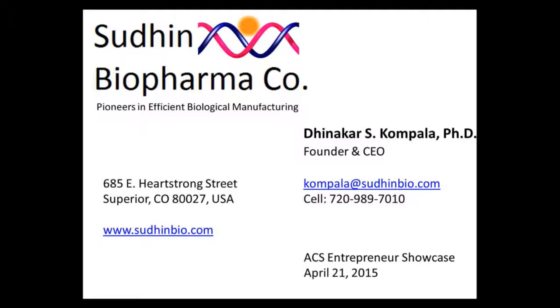So you separate 2 micron sized particles from 4 micron sized particles? Yes, and that has not been possible with the previous design. With our design right now, we're working with yeast cells that are 5 micron, and the dead cells are probably 3 micron or smaller. So it's very close, but not exact. The smaller the cell size, the larger the device you need. But because it's a 3-dimensionally scaled up system, all you need is to add one more layer of rings and you're almost doubling the capacity. So if you can fit this on one of our reactors, we'd be happy to try it for you. I have one, we'll talk.